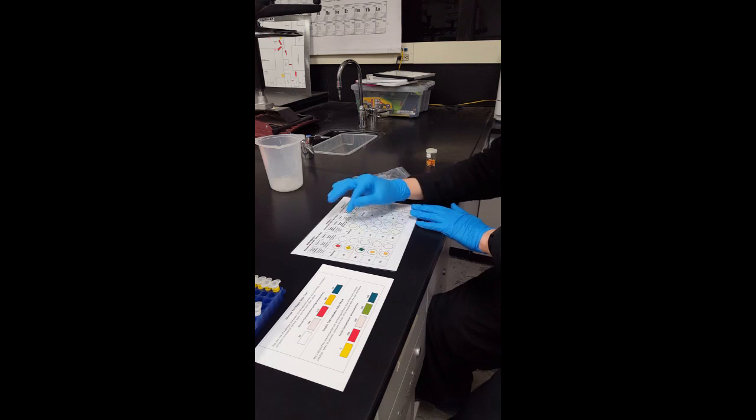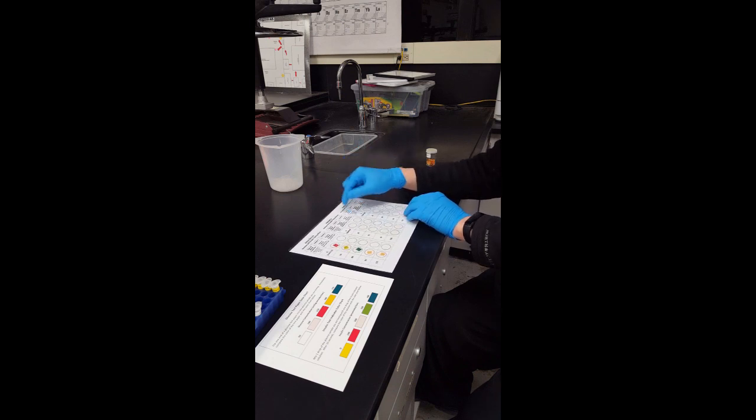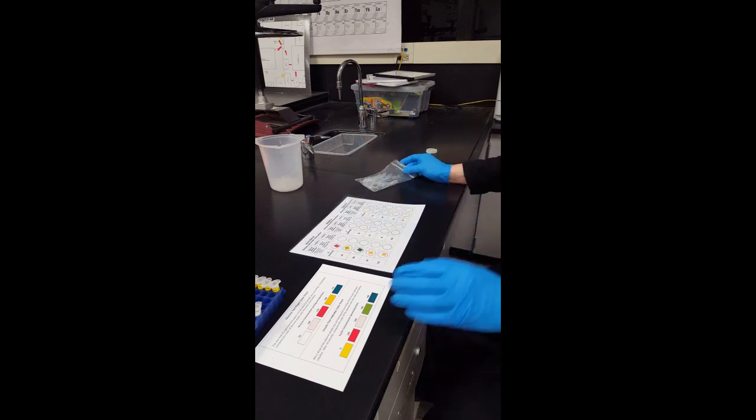To make it a little easier to actually see the colors because the table is black, you want to put like a white sheet of printer paper underneath your transparency right here.